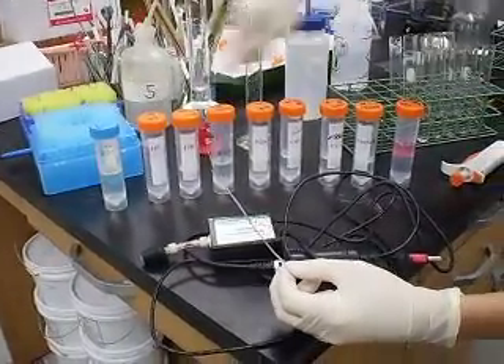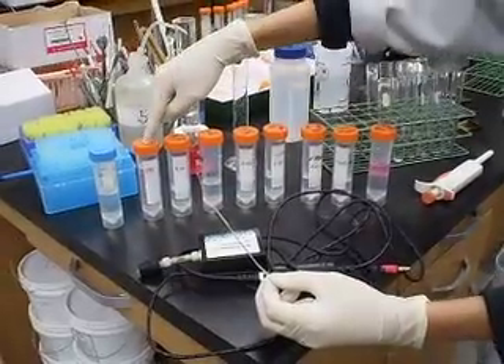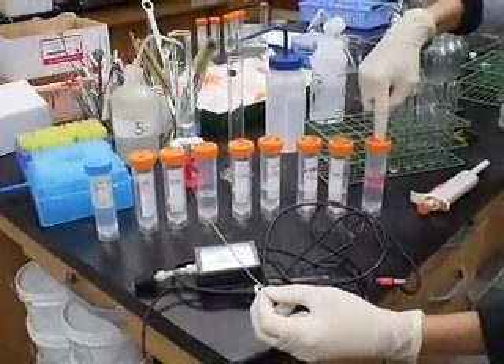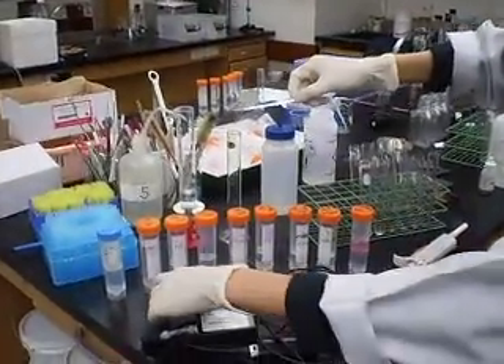I did a 2-fold serial dilution from 1M: 0.5, 0.25, all the way down. So this goes from most concentrated to least concentrated. There will be a reaction between magnesium and hydrochloric acid.